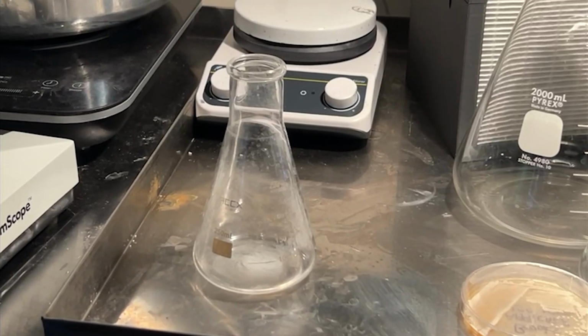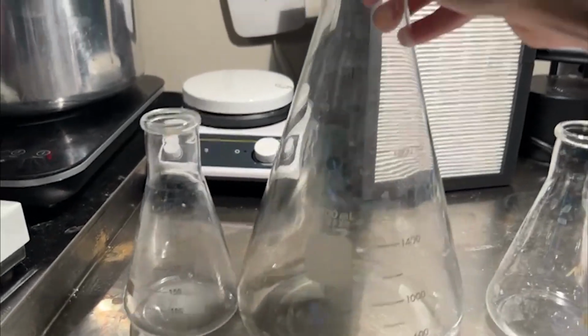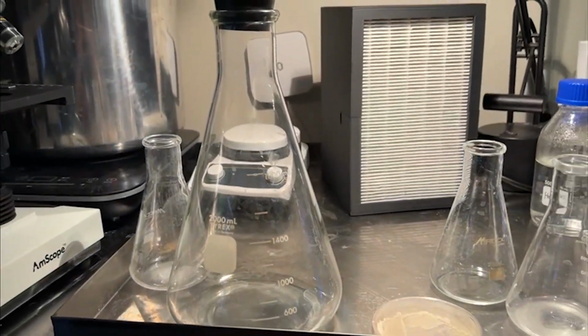I began preparing for the streptomycin extraction by first weighing out the ingredients I would need for the liquid media I was going to use, which I will refer to as the fermentation broth. Because of the slower growth, I wanted to try starting its growth in a smaller vessel with only 50 mils of the fermentation broth, so I could make sure it actually grows properly, so I could then add that to 600 mils more of the broth for the final incubation.